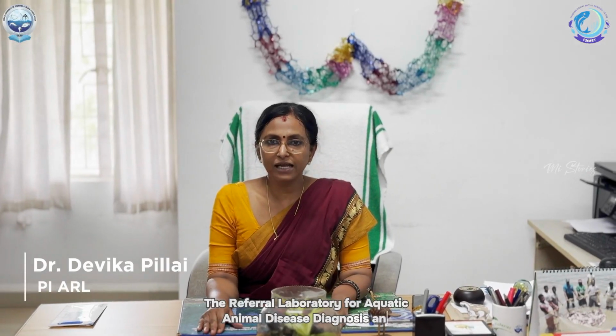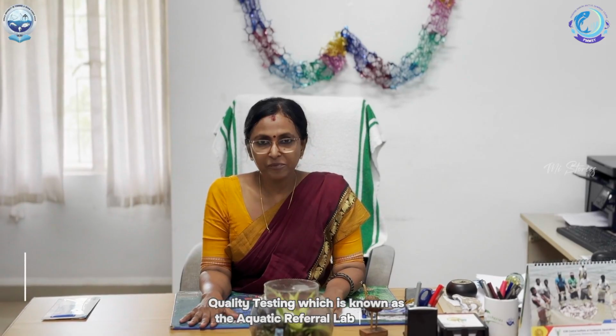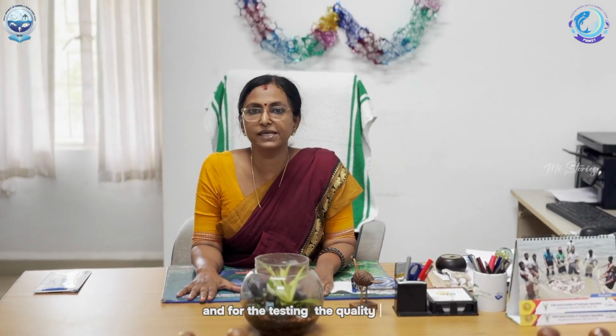The referral laboratory for aquatic animal disease diagnosis and quality testing, which is known as the Aquatic Referral Lab in short, has been established under the Pradhan Mantri Matsya Sampada scheme. With funding to the tune of Rs 975 lakhs from the central and state governments, this lab is equipped with state-of-the-art facilities for diagnosis of aquatic animal diseases and for testing the quality of soil, water and fishery products.